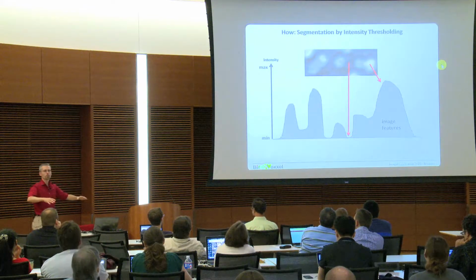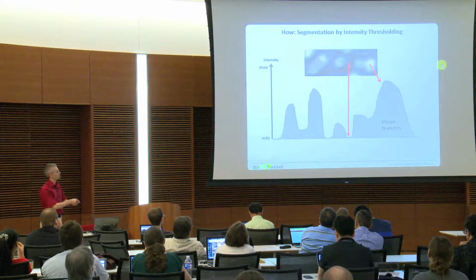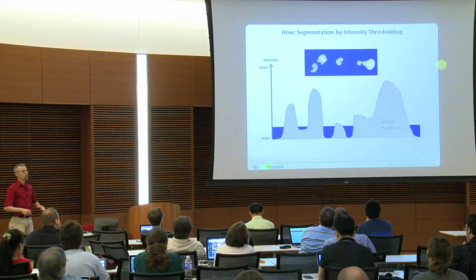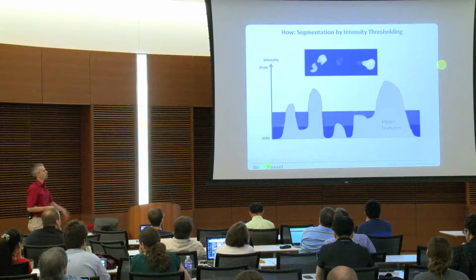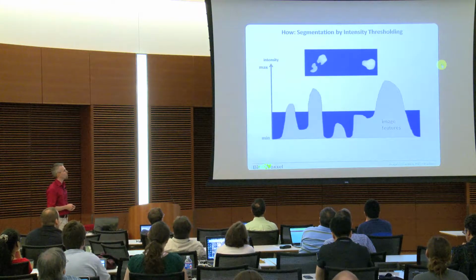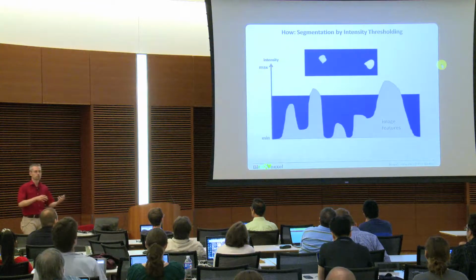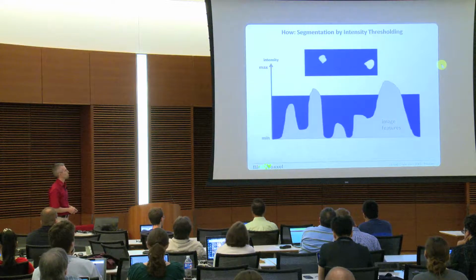So you have peaks for bright objects, and valleys for the dark areas. Here's the intensity range, and now if we flood that landscape, everything below the water level is basically eliminated and the rest is kept. The higher the threshold is, the more is eliminated, so it's extremely crucial to find one cutoff value which gives you an extraction with not too many false positive and not too many false negative pixels, and that is exactly what is not trivial.